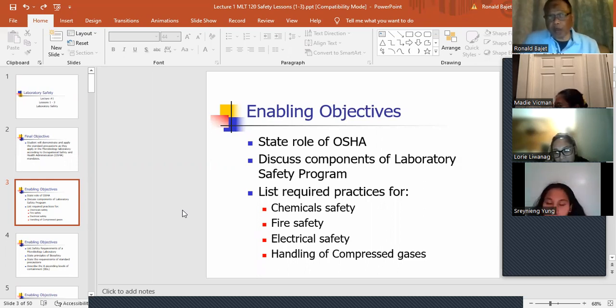your hospital $100,000. And can you imagine how embarrassed you would be if they found four violations? Another one is if your instrument is pumping waste directly into the drain, and they ask you where does this drain lead to, and you say, oh, I don't know, I think it drains out into the bay. Guess what? Wrong answer. That's going to be a hit. And that's a major hit too, especially with safety and the EPA. So yeah, an OSHA hit will cost the organization $25,000.